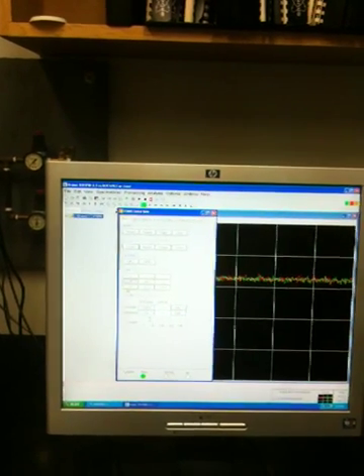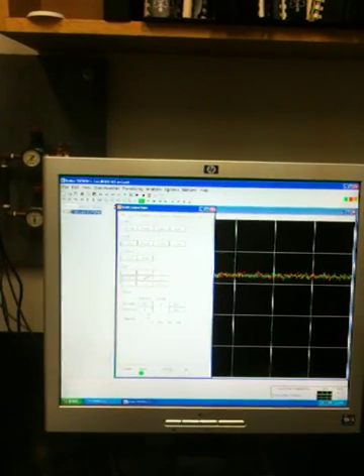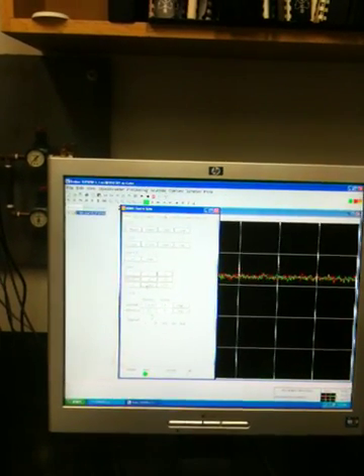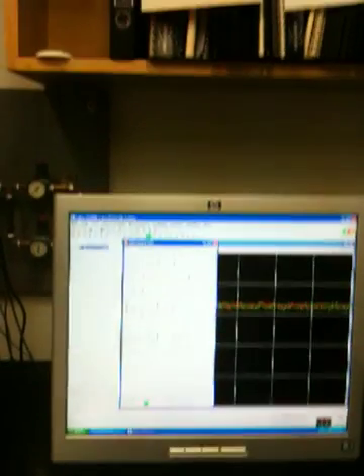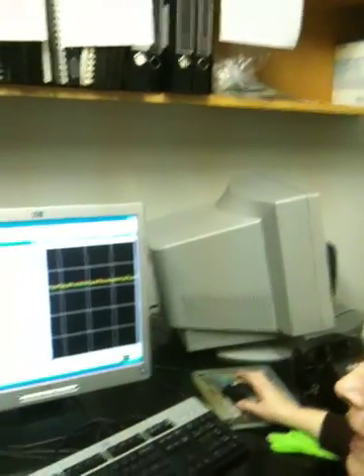Then you would do this on Z squared. Do not touch the rest of them. The rest of them were set with that RSH command. Again, we were evening the field around the sample. In the next YouTube, I'm going to actually run the spectrum.